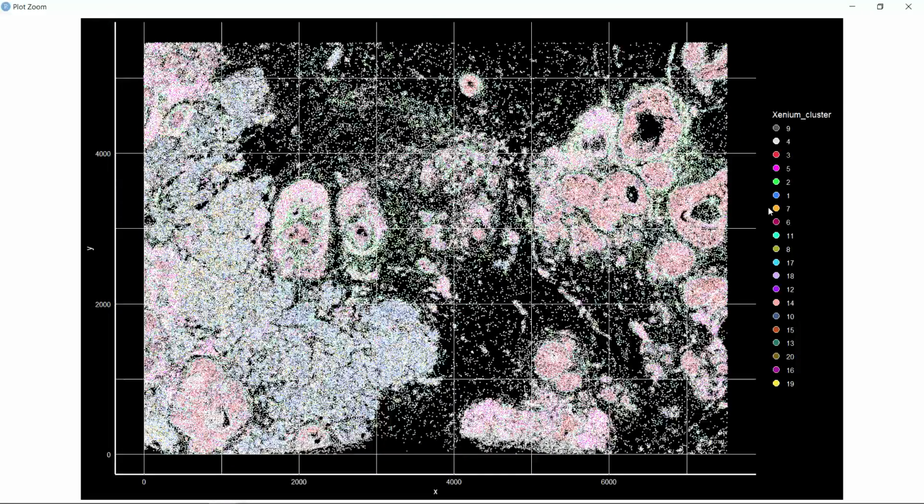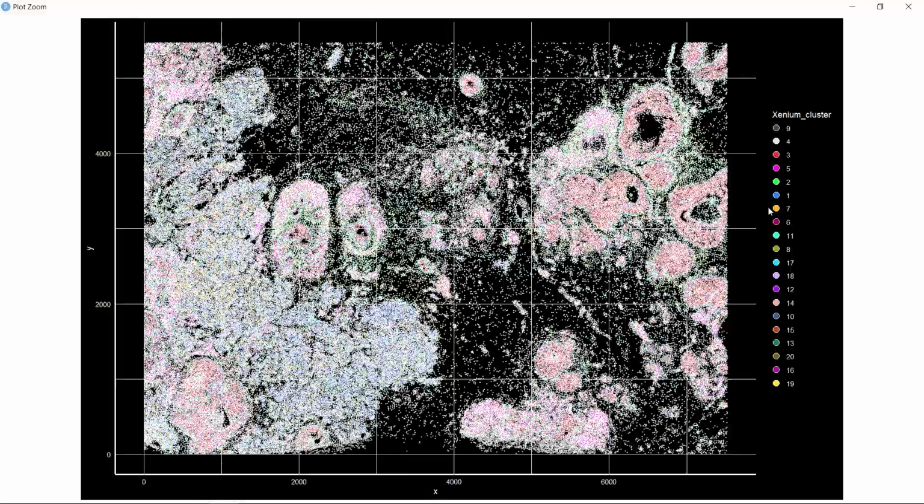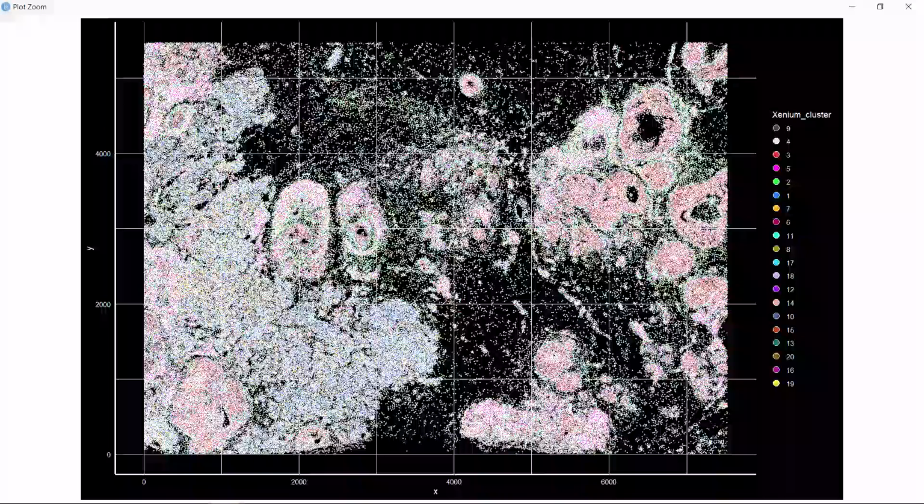Okay, that's today's video tutorial. I showed you how to recreate the Seurat cell clusters and the spatial image from the Xenium onboard analysis. Once you recreate the Seurat object with the same cell clusters, you can perform further analysis such as the identification of differentially expressed genes. So I'm going to stop here for today's demonstration. I hope my video tutorial could help your data analysis.